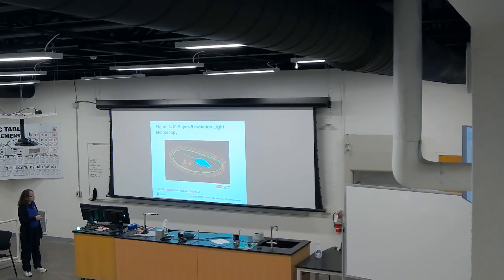So in this case, you cancel most of the light coming from the cytoskeleton, and you still stain the nucleus. You can see part of the bottom in the three-dimensional shape. Like if you were looking at extensions here, that's what you see here in the middle. It's not part of this cytoplasm.